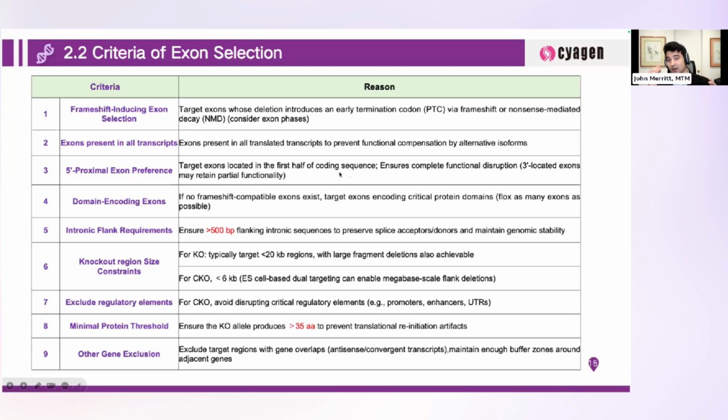So if we find that there is functional compensation and all these tricky mechanisms that the mouse has to restore function, then we might just take an ES targeting strategy and knock out everything, just end to end, when we don't want any question about any sort of fragment coming in and compensating or something. So sometimes we'll do that if we can't meet all these criteria.